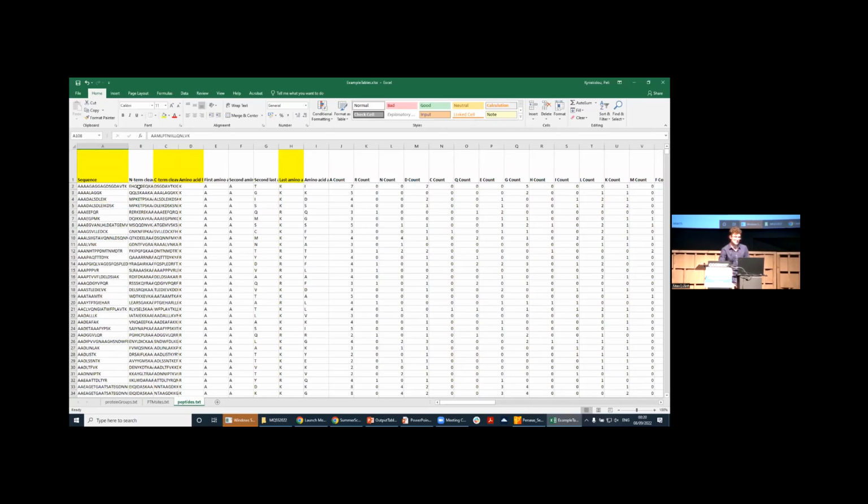So you get the N-terminal cleavage site and C-terminal cleavage site, just meaning that here in the middle there was a cut, and this is the region around where it was cut in the protein. So you get the amino acid before cleavage, and obviously, if you digest with trypsin, it should be these two letters. If not, you could ask what's going on there. And you can also check by the sequence of your peptide if there were any miscleavages, so if some possible cleavage site was missed.